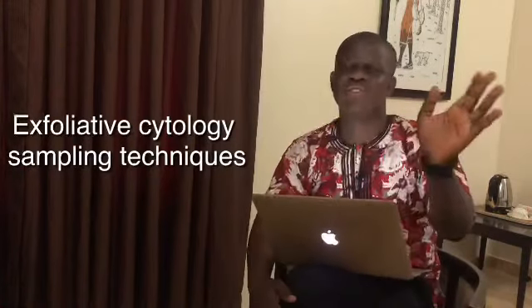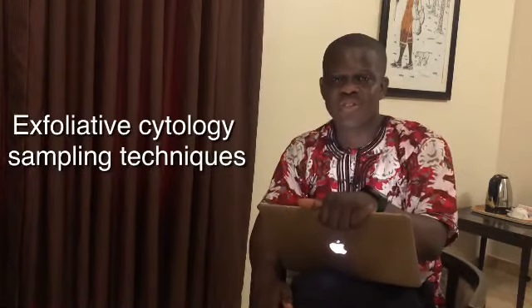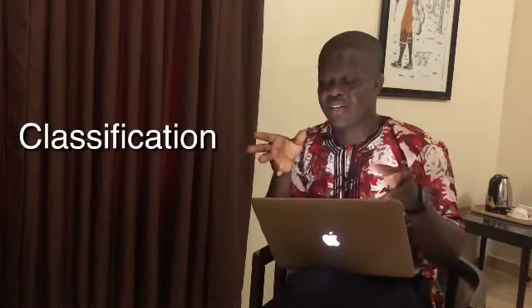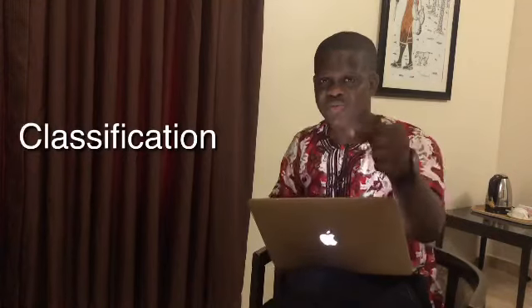So let's quickly talk about the various collection methods. You can mention cytology sample collection methods that you know. There are lots of them, and I know you know lots of them, but there are different methods of classifying them. If you open various textbooks, you'll find different methods of classifying exfoliative cytology sample collection methods.